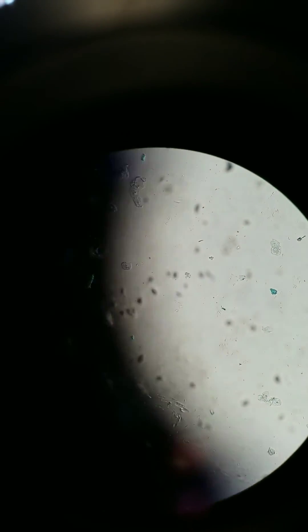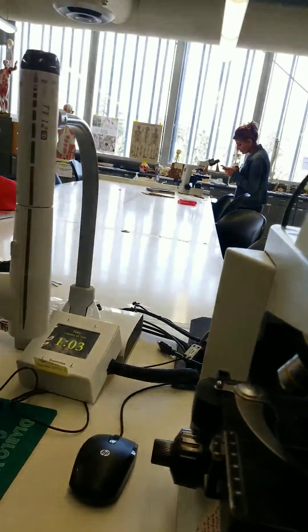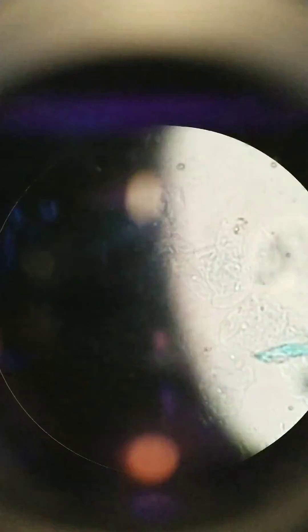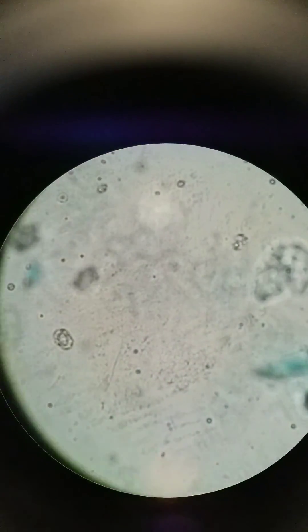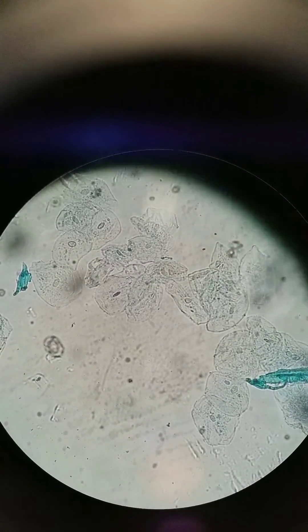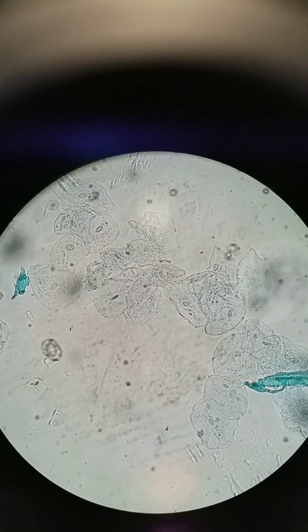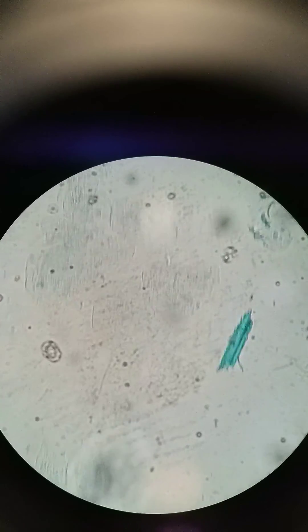I'm going to move to 100x total, and we can see the cells a lot better. There — a lot of cells here. You can see the nuclei, the dots at the center. I'll go one closer. You can see a lot of cells overlapping here. So those are my sloughed-off, non-keratinized, stratified squamous cells — all individual, spread out on this slide.